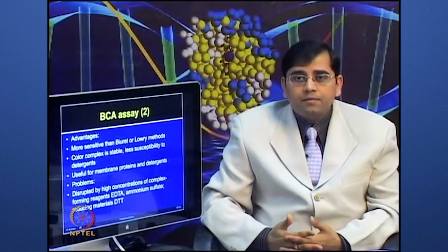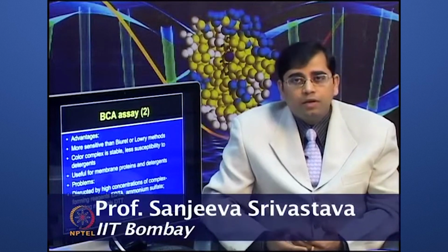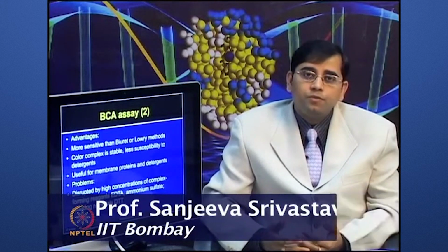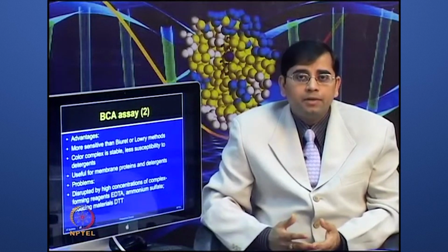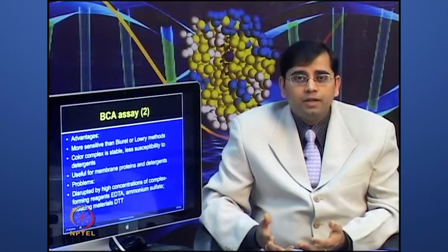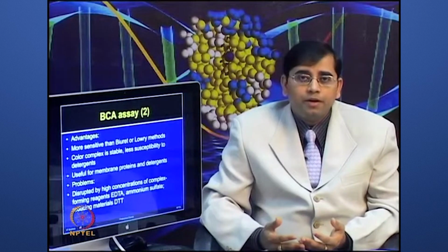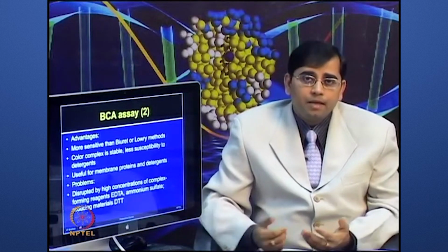So, people have tried different types of assay methods for protein quantification, because there are many interfering components which could give you a false reading, and if you are unable to accurately determine the protein concentration, then your whole analysis is going to depend upon that, and it will not lead to the right results, right comparison. Many times you want to compare the controls and the treatments, your 50 controls with the 50 disease samples.